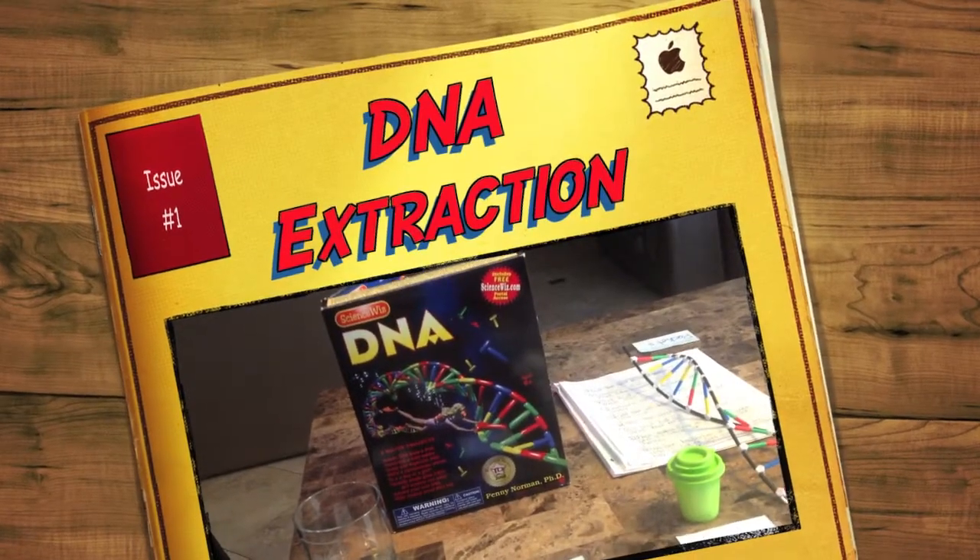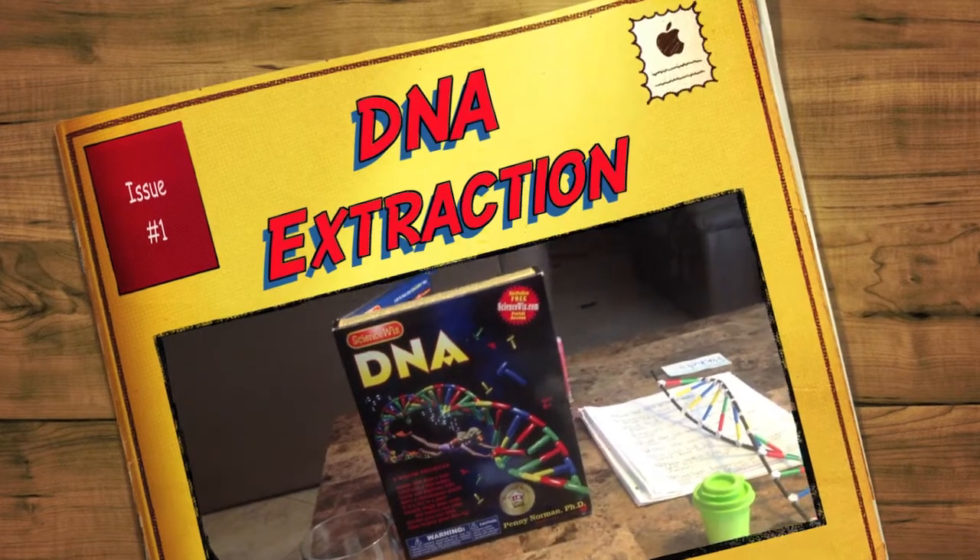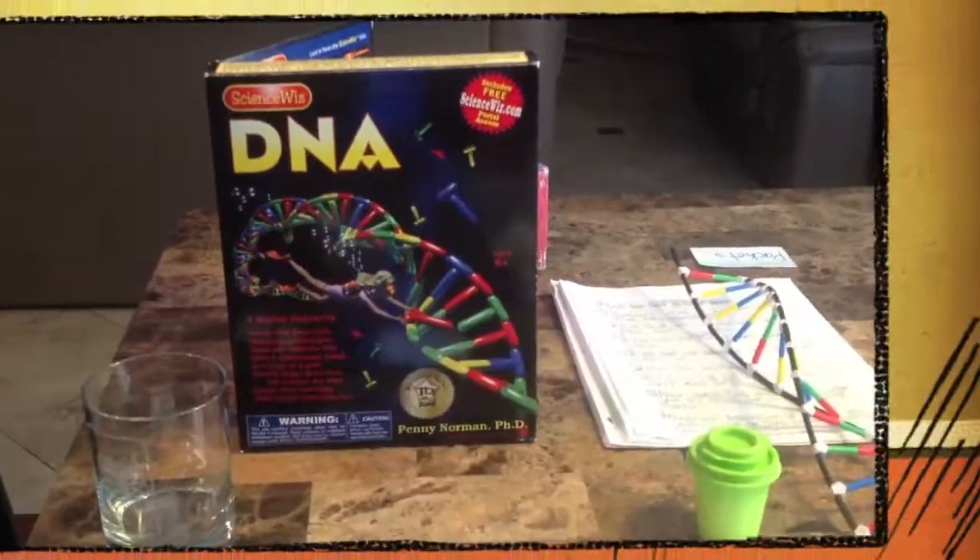Hi, today I'm going to show you how to isolate DNA from a fruit using the ScienceWiz DNA kit.